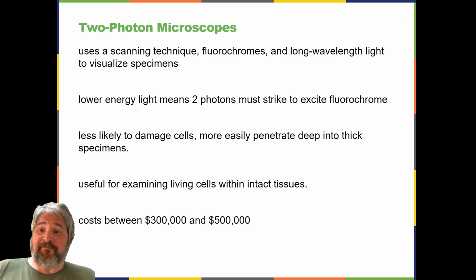Two-photon microscopes. While the original fluorescent and confocal microscopes allowed better visualization of unique features in specimens, there were still problems that prevented optimum visualization. The effective sensitivity of fluorescence microscopy when viewing thick specimens was generally limited by out-of-focus flare, which resulted in poor resolution.